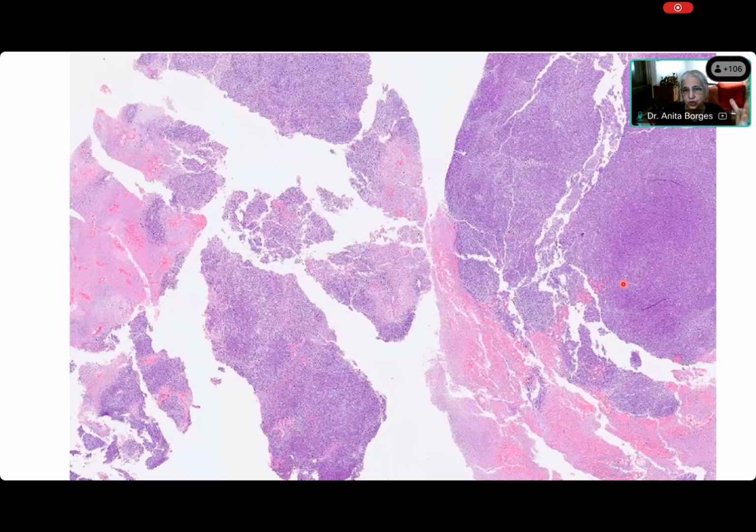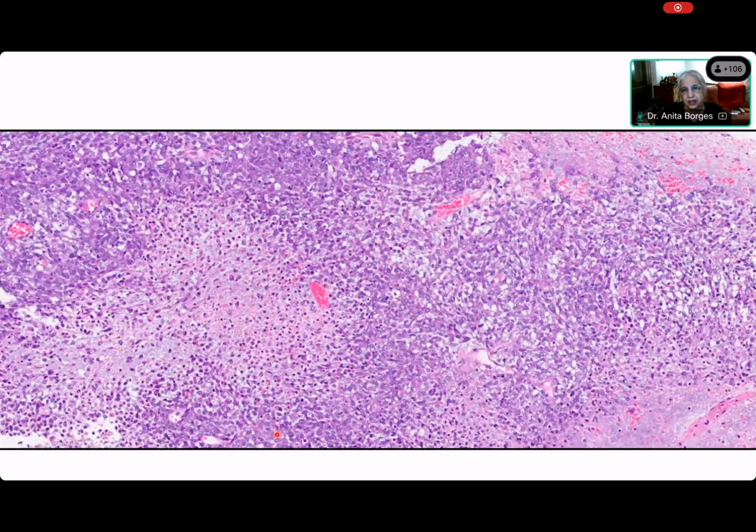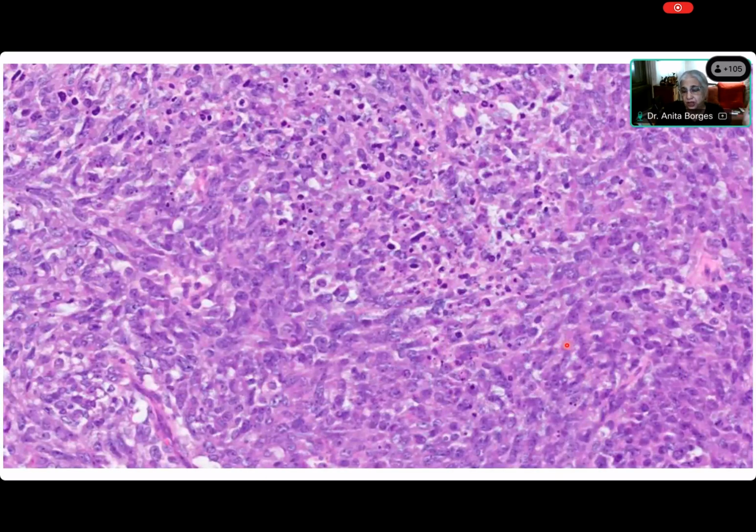And then when you see an extremely cellular tumor, look at this. Okay, it is spindle cell. It's also to some extent epithelioid. And look at the necrosis. This cannot be what? It cannot be a synovial sarcoma, no matter what anybody says. Okay? Yes, it has spindle cells. Look at the amount of necrosis that is present. And you're right, these spindle cells are not in fascicles.